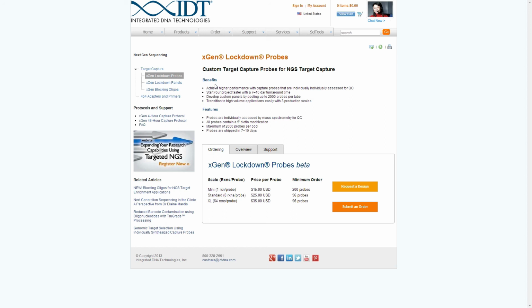Okay, here's another application-specific item. This person wants to know if you can capture DNase-1 hypersensitive sites, and they said that the DNase-1 hypersensitive site library is short, again, less than 30 base pairs. So it's, I guess, kind of repeating the same thing. So they can't make the library longer than 30 base pairs.